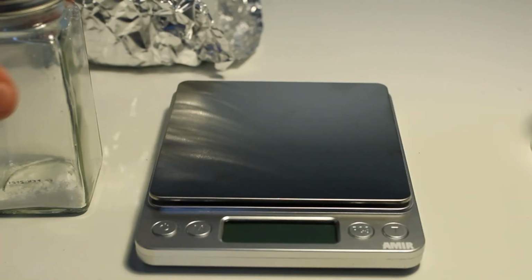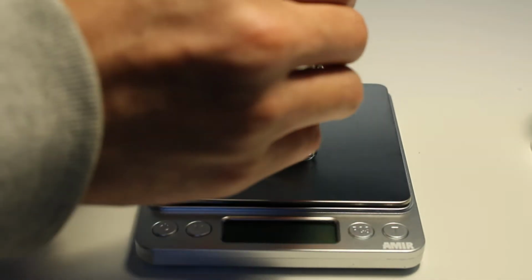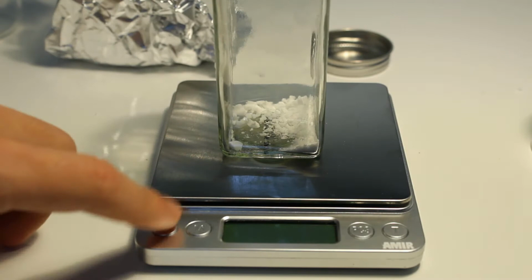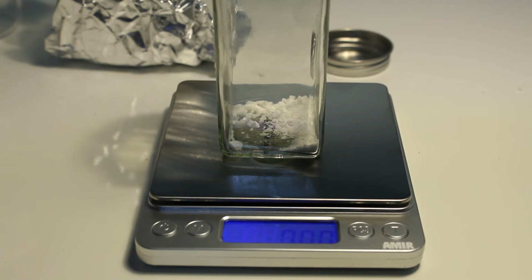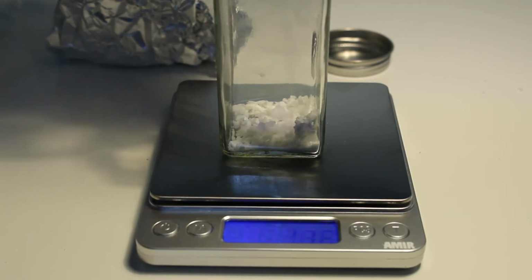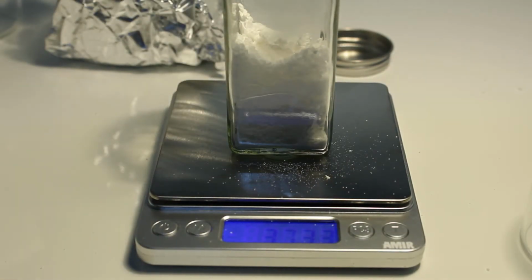It's time for yield. I'm gonna put it in this nacho container. It's just because the chemical name looks like nacho, so we're just gonna call it nacho. So turn it on. This is stuff I had made beforehand, not part of this reaction, therefore is not significant, and we can just zero that out. But here's the stuff that we have made now. And our final yield is 37.33 grams of sodium citrate.